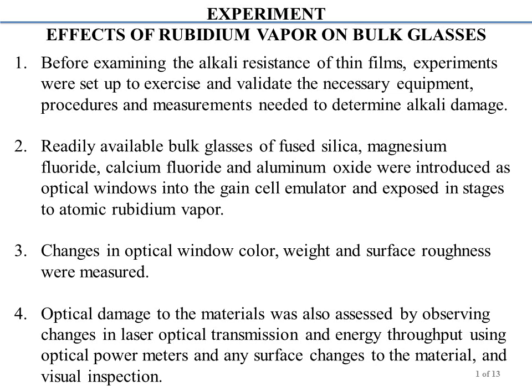Gases, experiments that were performed essentially before examining the alkali resistance of the thin film. Experiments were set up to exercise and validate the necessary equipment, procedures, and measurements needed to determine alkali damage.